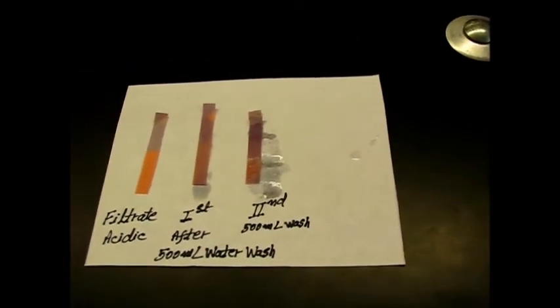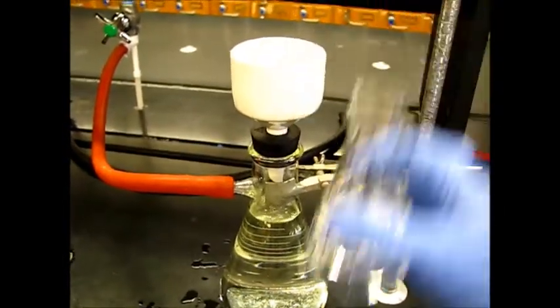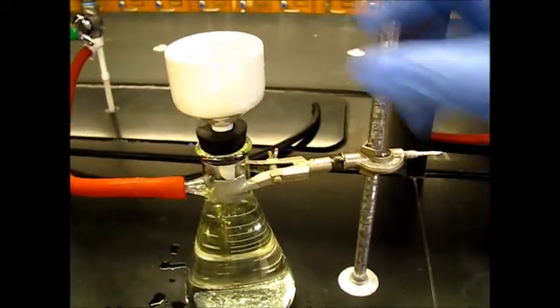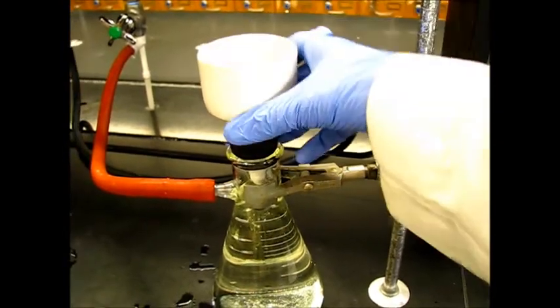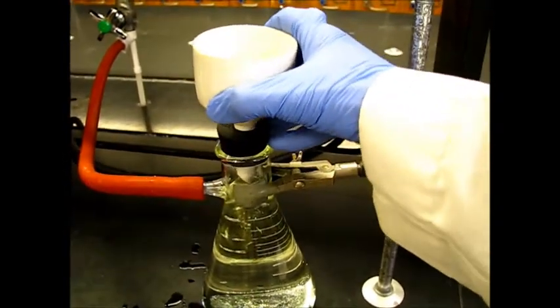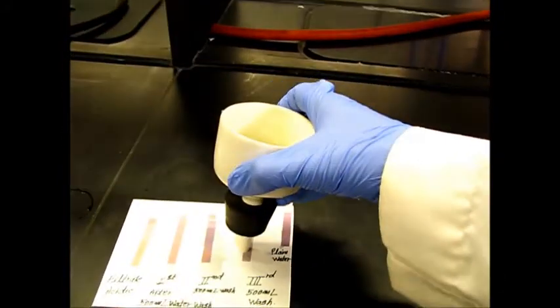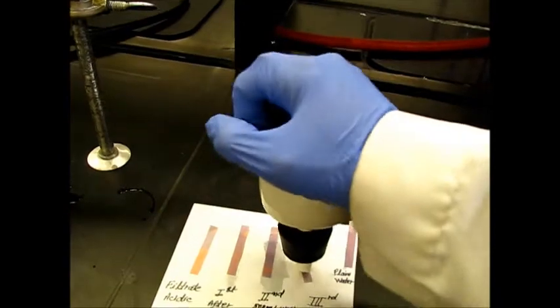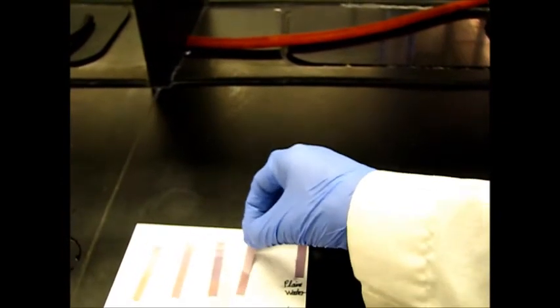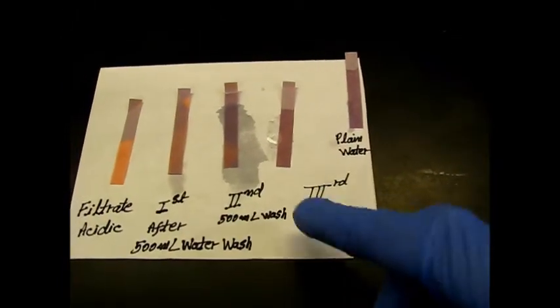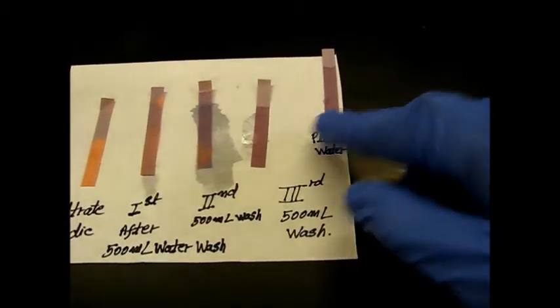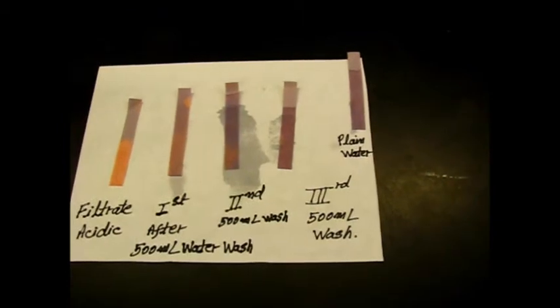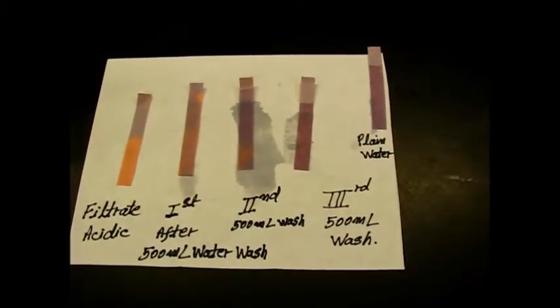This is the third and final wash, so basically right now we have 1.5 liters of wash. Let's check the pH now. This is from the third wash, and if we compare all three washes with this plain water pH, this is very close to the plain water. Now it's time to recrystallization.